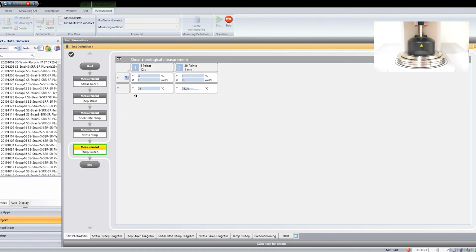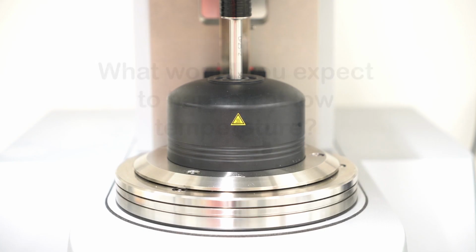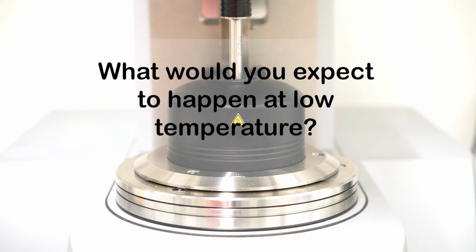Up to now, all measurements were done at room temperature. In a temperature sweep, we apply a constant strain amplitude and constant frequency, but we decrease the temperature of the material. Based on what you have read in the script, what would you expect to happen at low temperature? Sketch the material properties.